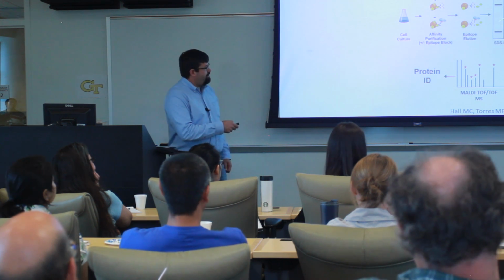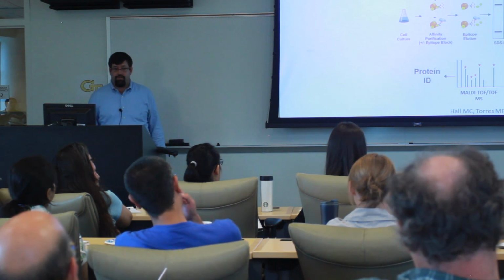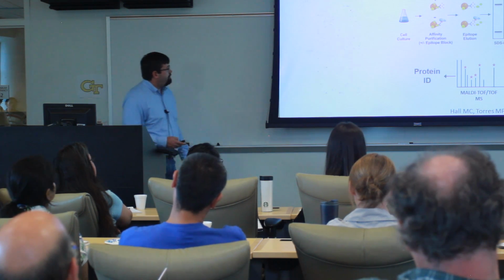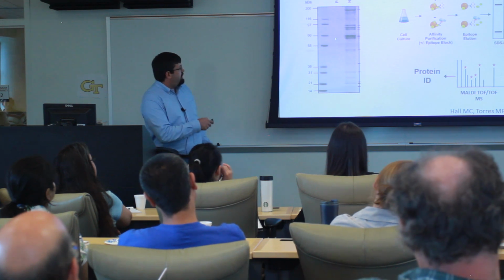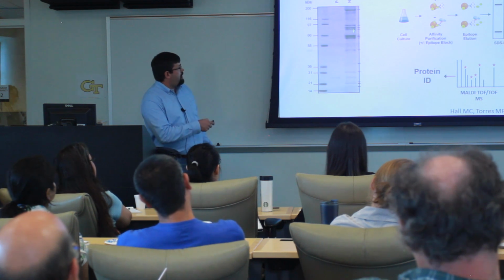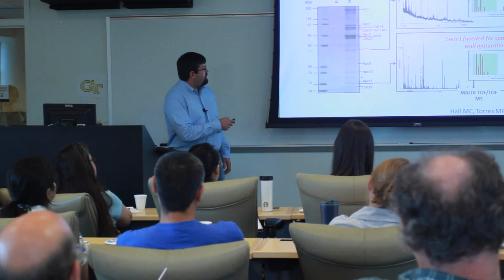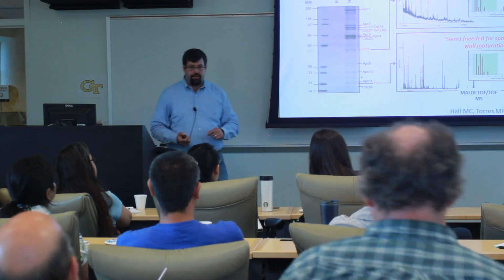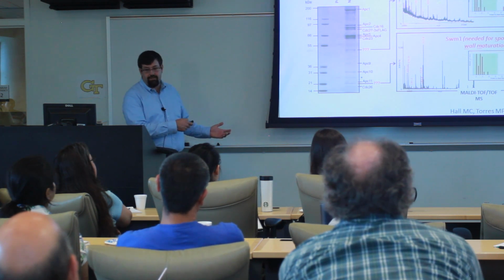We run those on SDS-PAGE, do an in-gel digest, and MALDI-TOF MS. This is actually done on an ABI 4700, just like the one that we have here in our facility, and then the protein is identified. So here's the SDS-PAGE gel. Here's the peptide block lane. This is stained with Coomassie. And then these are bands that are specific to the no peptide block, or the protein complex lane. So we identify each one of those protein complex components simply by cutting the band out, digesting it with trypsin, extracting the peptides, and analyzing by MALDI-TOF.